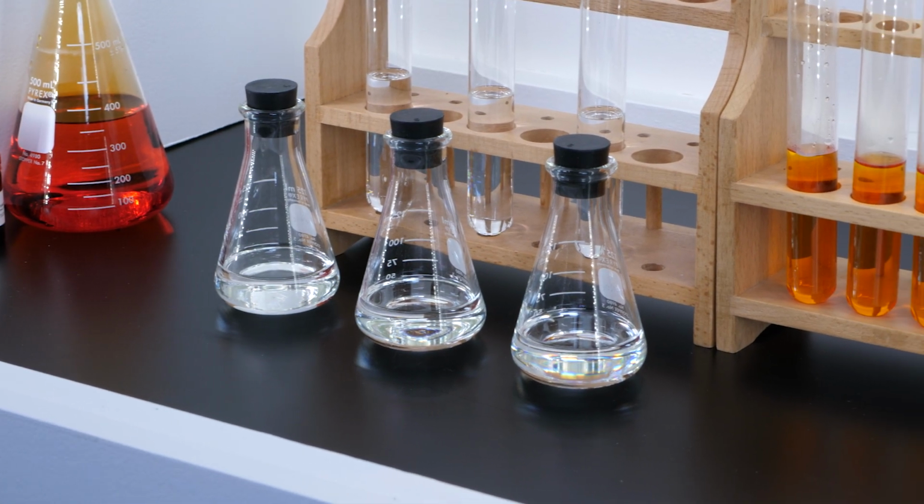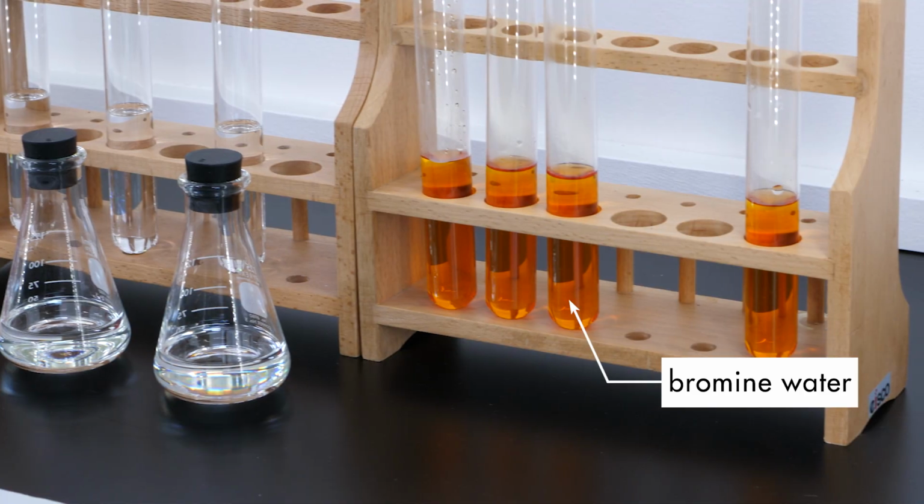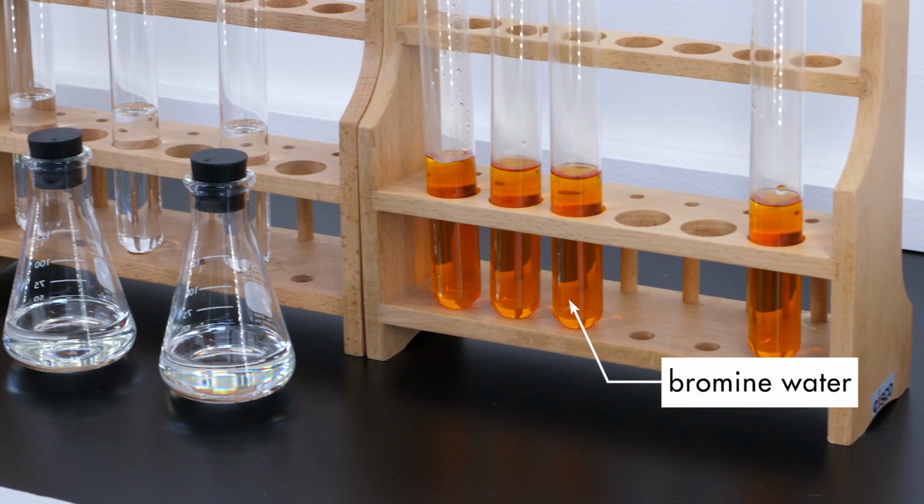To test a hydrocarbon to see if it is saturated, we can use bromine water, which is the element bromine dissolved in water. Bromine water has a characteristic orange color. If bromine water is added to a saturated hydrocarbon, no reaction occurs. The mixture of the saturated hydrocarbon and bromine water turns orange and remains that color.